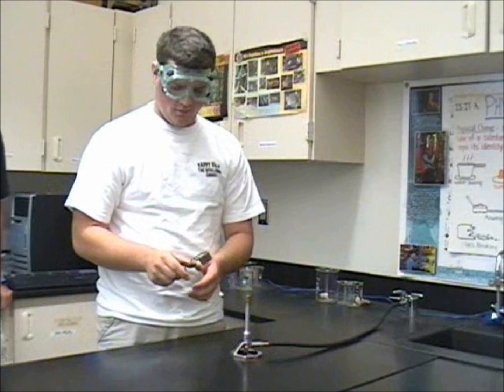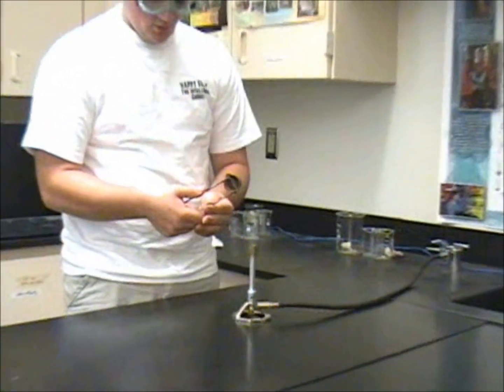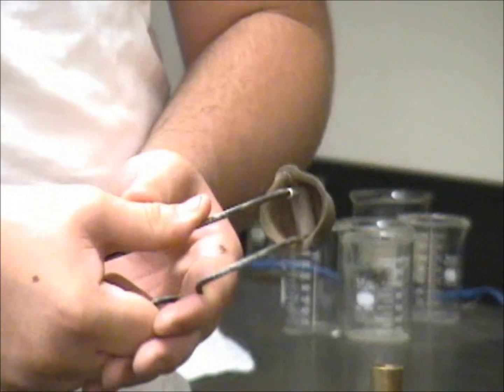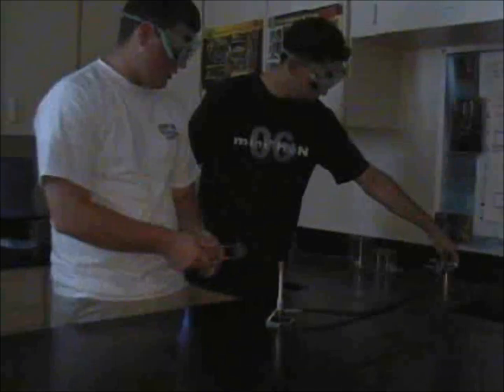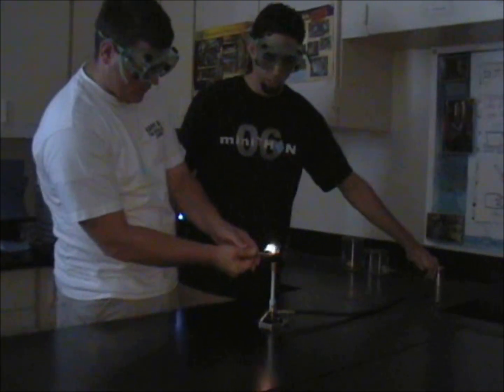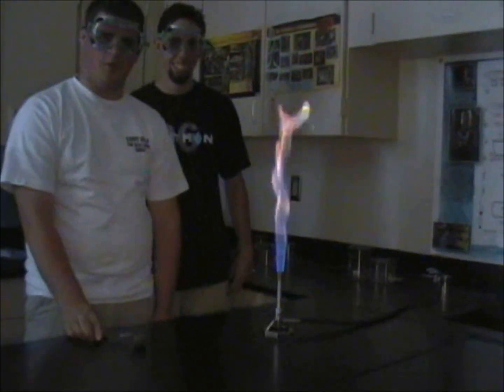To actually light it, you need a striker. The way to use a striker is you place your hands right around where the bends are and you take your thumb and push in, then squeeze with the other hand. If it works, you get a nice spark. Then you have a friend turn on the gas. Right when he turns on the gas, you want to start holding it about an inch over and strike. And then there, that's the proper way to light a Bunsen burner.